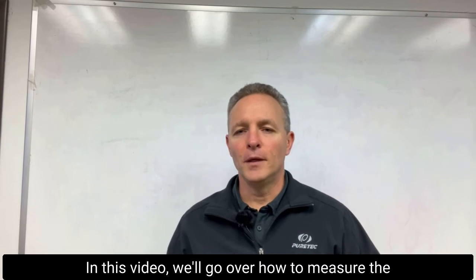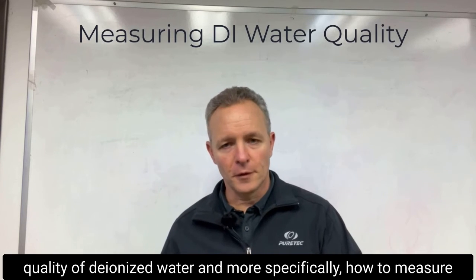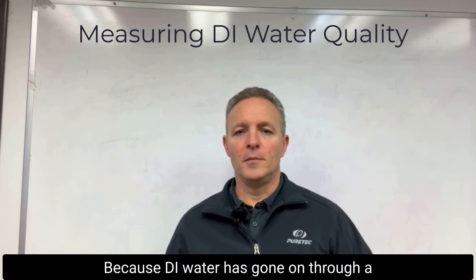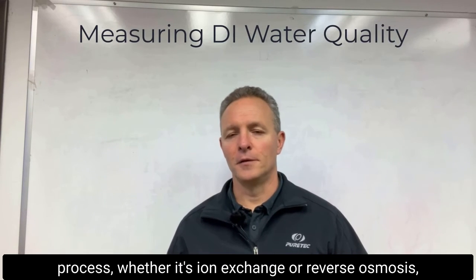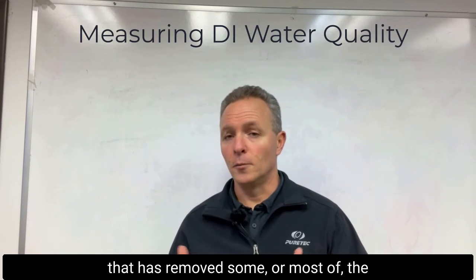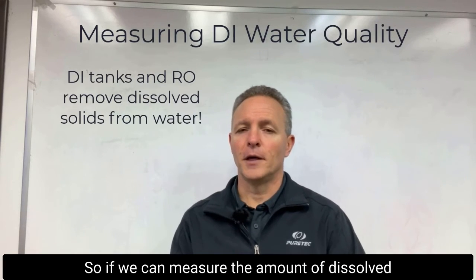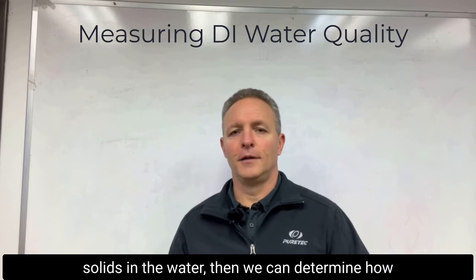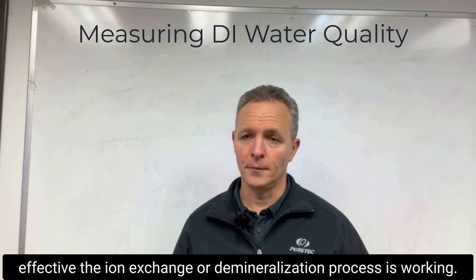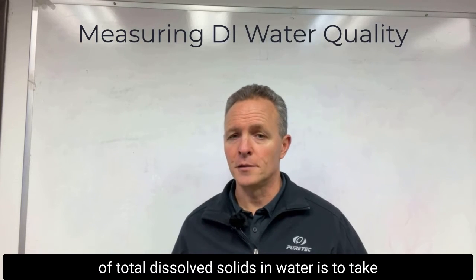Hi everyone. In this video we'll go over how to measure the quality of deionized water, and more specifically how to measure the amount of dissolved solids in the water. Deionized water has gone through a process — whether it's ion exchange or reverse osmosis — that has removed some or most of the dissolved solids. If we can measure the amount of dissolved solids, we can determine how effective the ion exchange or demineralization process is working.